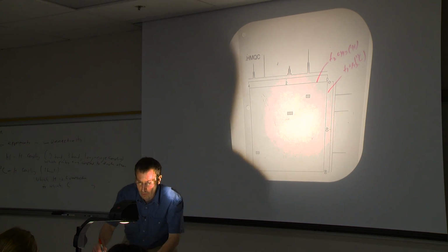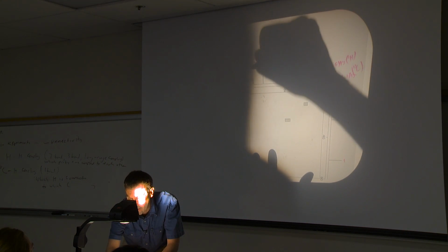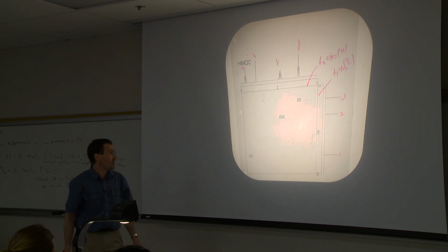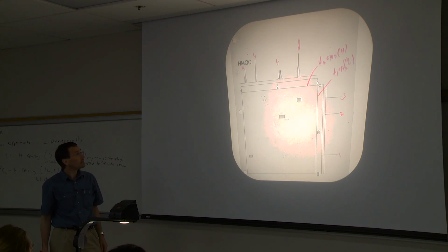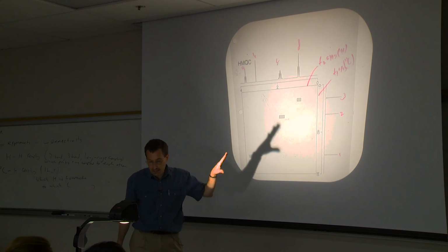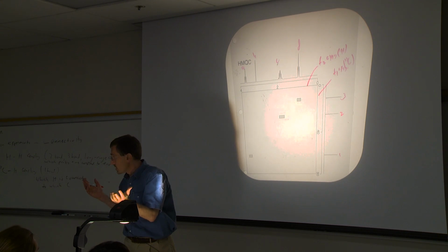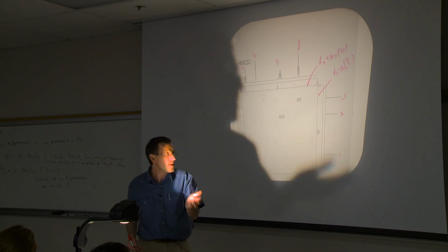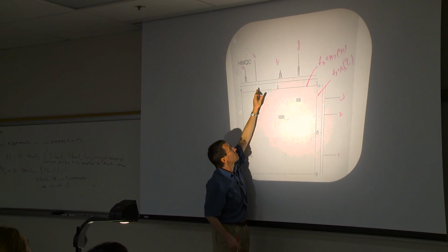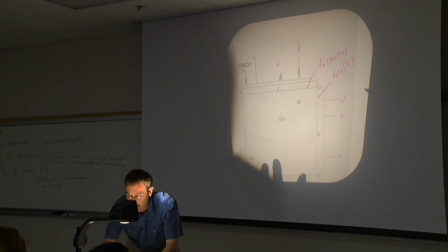What I like to do is I like to number my carbon resonances and letter my proton resonances. So I call my proton resonances A, B, C, D. I call my carbon resonances 1, 2, 3, 4. I like to letter and number my resonances because I know resonances. I may not know what they correspond to, but I know, oh, there's a peak here, there's a peak here, there's a peak here. What we can then do is figure out how those resonances connect.